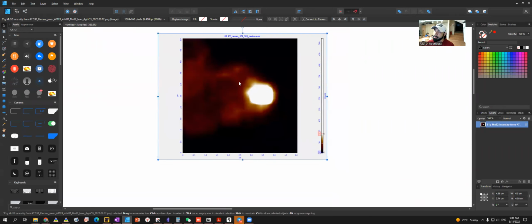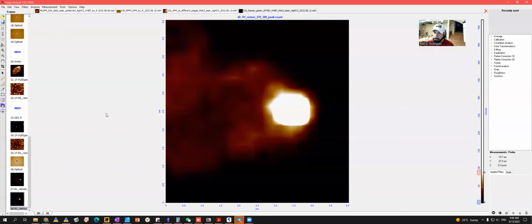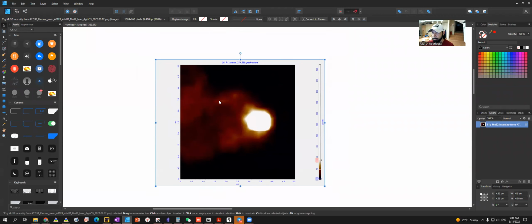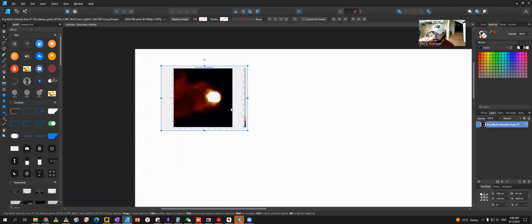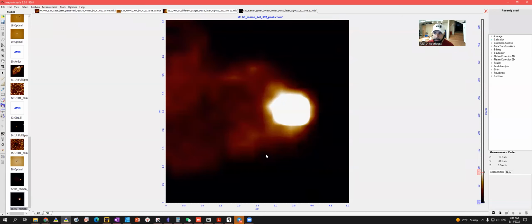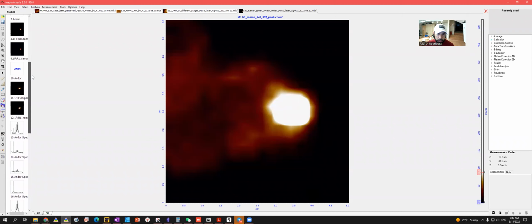So then I'm thinking this is the best way to do it, or yes, using this sheet is avoiding. Yeah, let's do it this way. So once I have this one, the typical thing here, this file has all the dimensions I need. So I will do the same. Let's see if it works. I need the maps. I need the MX2 and I also need the molecule.